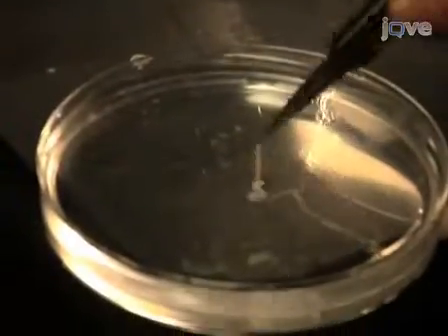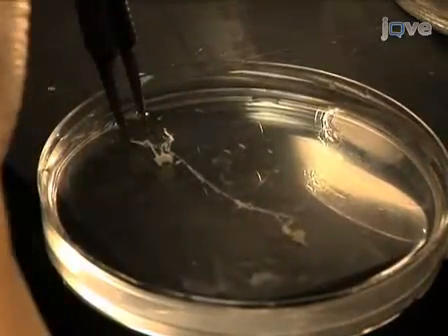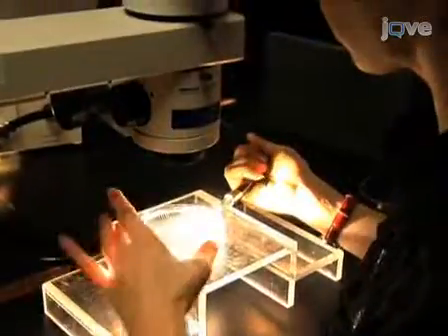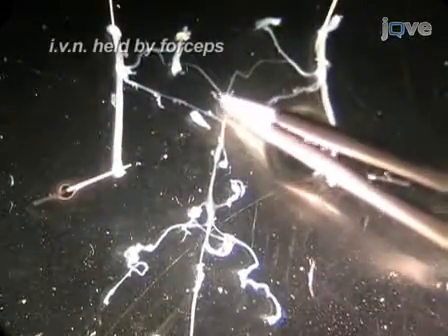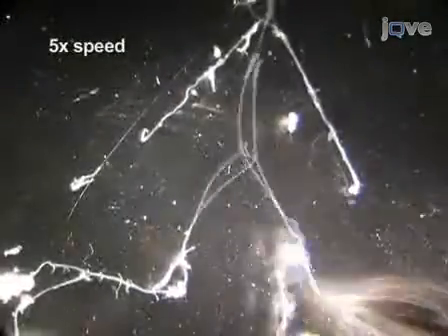Grab the upper ends of the commissural nerves with forceps and move the STNS to the clear silgard dish. The brain will still be attached to the commissural nerves to prevent tangling. Now prepare the STNS for pinning by severing the brain from the commissural nerves. Use minutiae pins to secure the four ends of the commissural nerves to the silgard. Ensure that the preparation is right side up by checking that the IVN is pointing up and that the DGN exits slightly beneath the STG. Pin the rest of the nerve ends down with the fine wire pins.